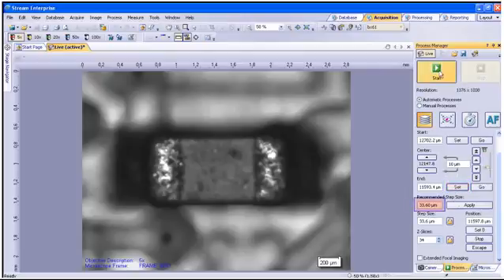You must verify the recommended step size value is set. If the step size is too far above the recommended step size, your image will come out with blur spots. You can hit the Apply button to have it default to the recommended value. The software sets this value automatically based on the function of the objective lens. Once the step size has been determined, it will display the number of Z slices required for this magnification and Z range. Once the settings are complete, you will simply press the Start button at the top.